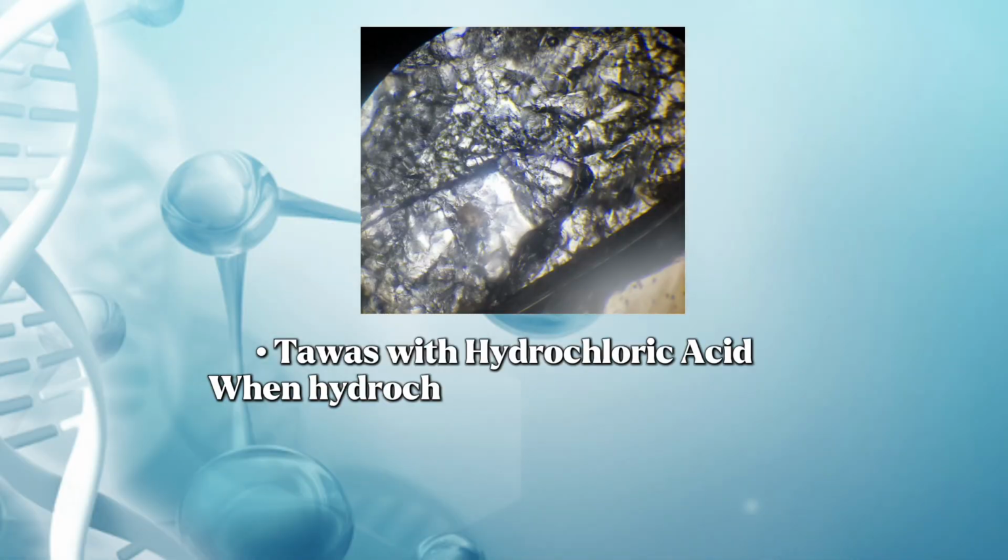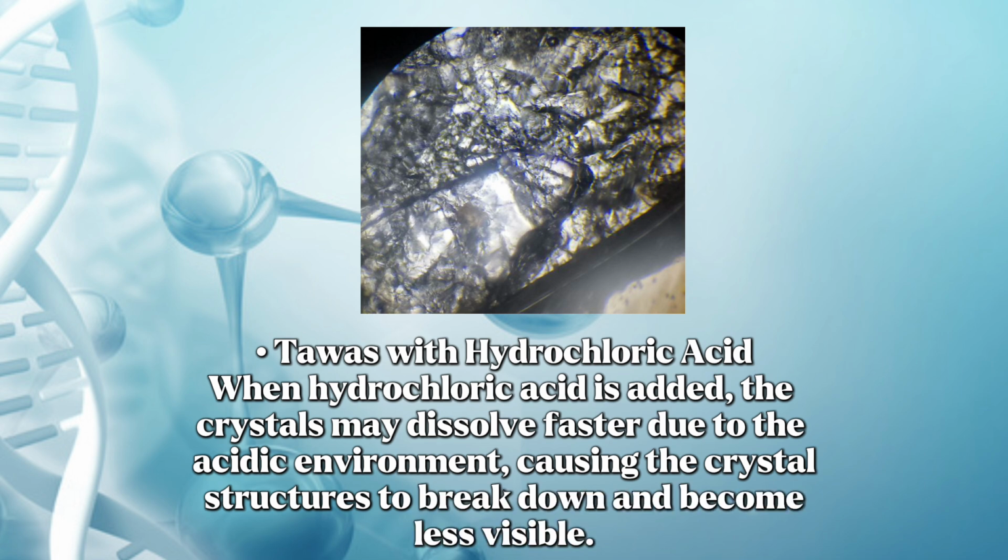Under the microscope, the crystals gradually shrink or disappear as they dissolve in the water. Tawas with hydrochloric acid. When hydrochloric acid is added, the crystals dissolve faster due to the acidic environment, causing the crystal structures to break down and become less visible.